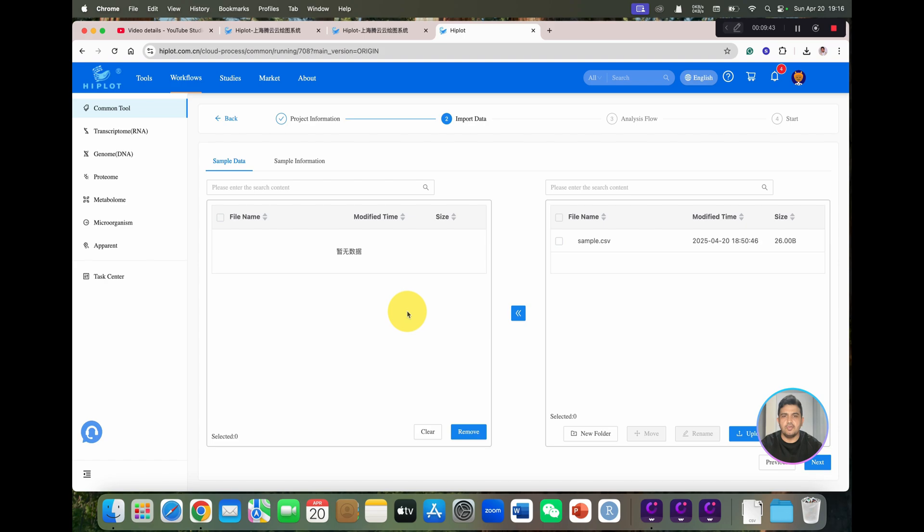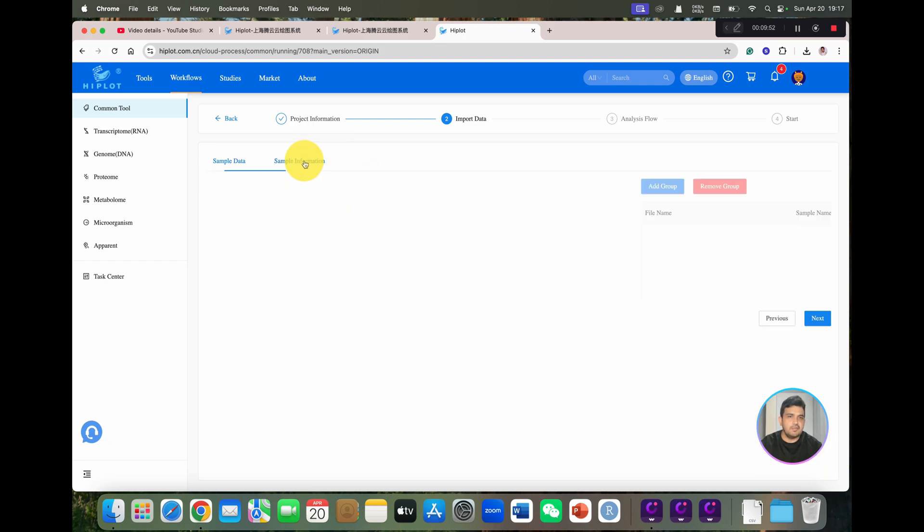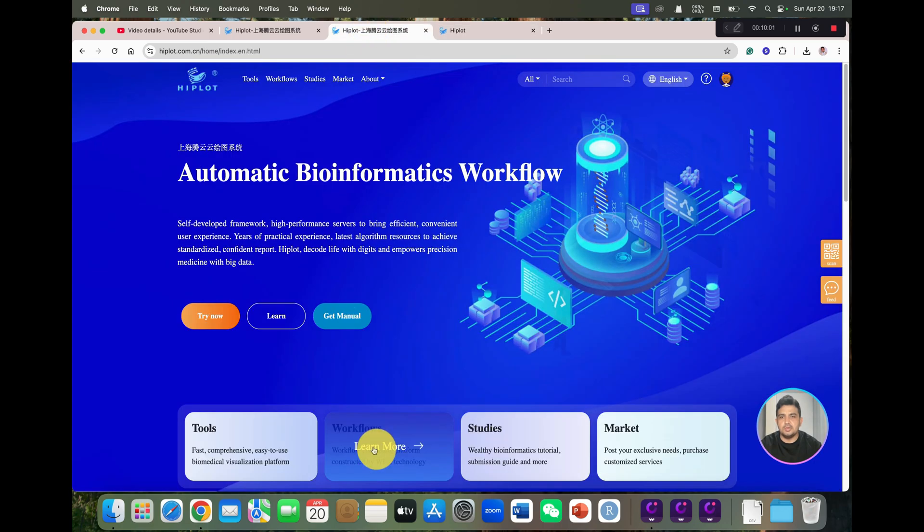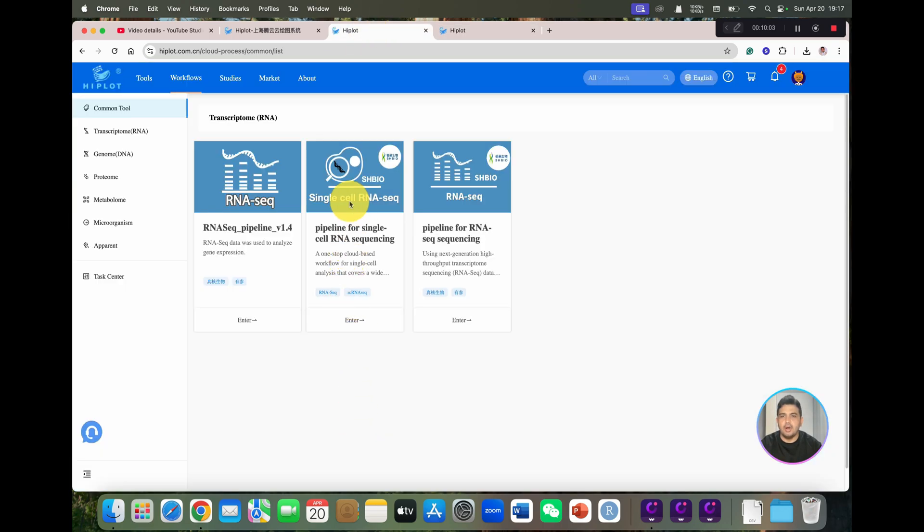You can see here now you can upload your sample data and sample information and upload all your files. If you want to download any template, you can download from here, and then the follow-on analysis will be done. In this way, you can explore all the workflows for single cell and RNA-seq through next generation sequencing as well.